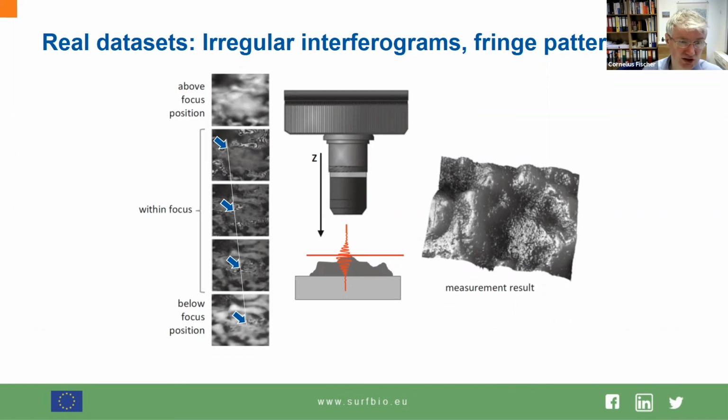Going to this section here, and here we reach the bottom already, and here we are close to the bottom and go with the focal plane below the material, and then no more fringes are visible.